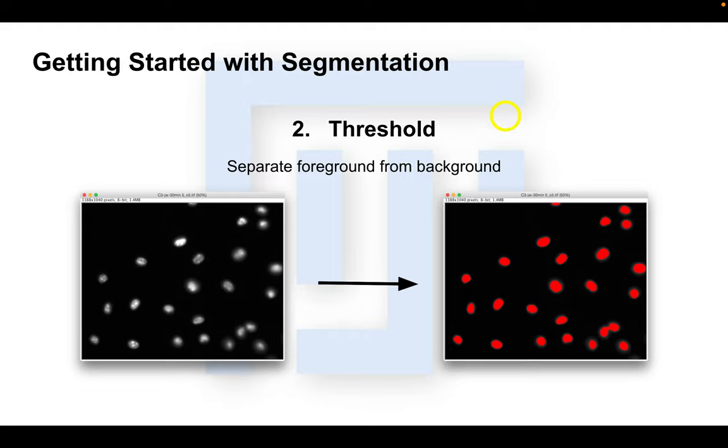Thresholding is probably one of the most common tasks in image analysis. In most cases in analyzing images, one wants to separate out objects of interest, or foreground versus background.